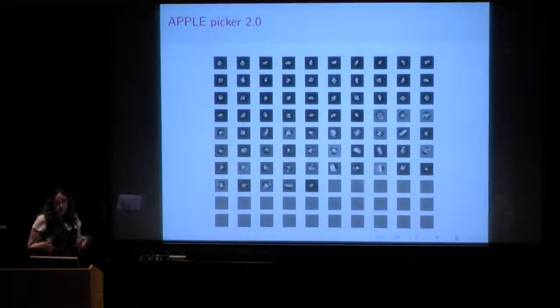So what we actually did is, we obviously didn't create at this point any 3D model of the particle, but what we said is that the center of mass of the 3D particle is always projected to the center of mass of a projection image. So all we need to find is the center of mass of the projection image, which sounds very easy, but it's pretty impossible due to the noise and due to the CTF.